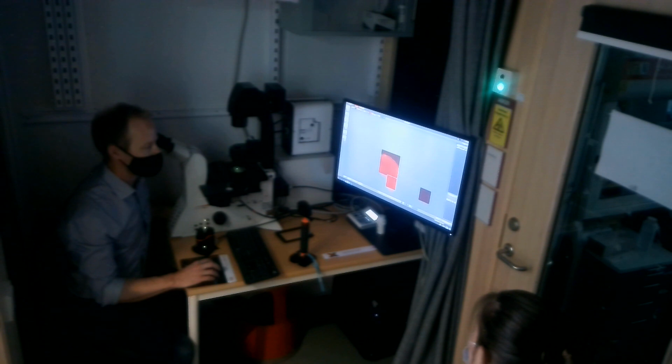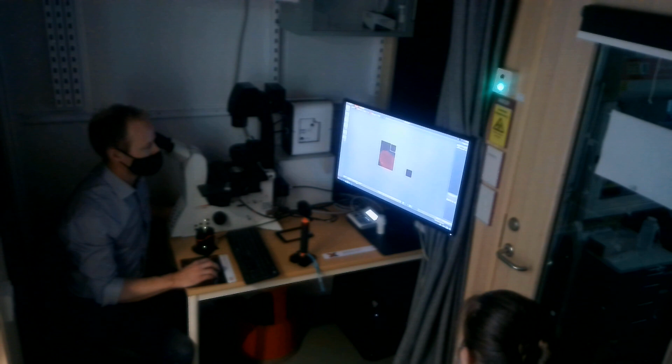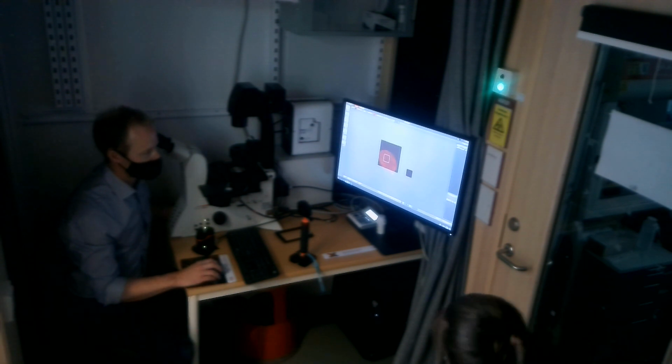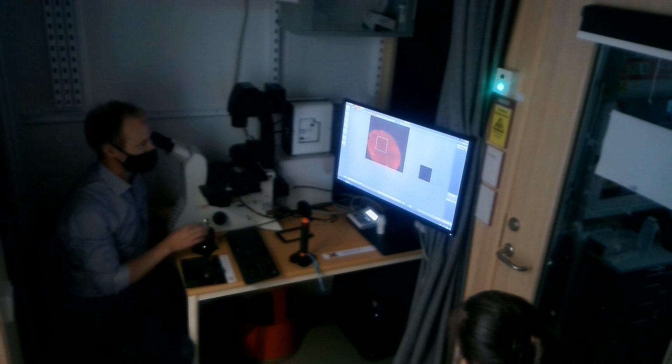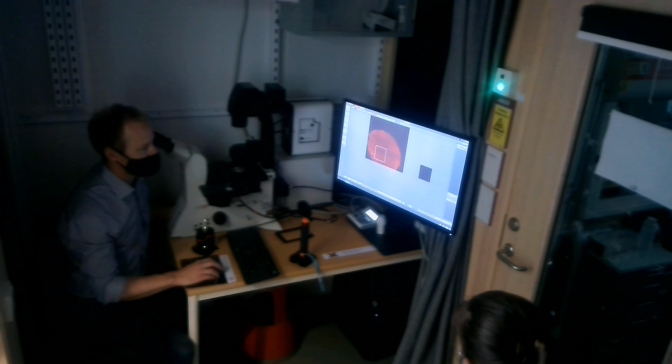With the 5x, we're getting a big overview, so really it can be faster to generate. So at this point here, I'm going outside. I'm taking a lot of fields that I don't really need. So I can stop this here. I would have continued, but now just to show what I can do. If it's starting to do a lot of stuff where you don't want, you can always stop it. You can go move somewhere else, and you can start a new spiral scan to actually see. Or you can also fill in the rest by double clicking.